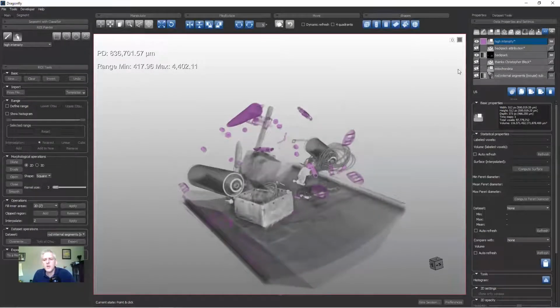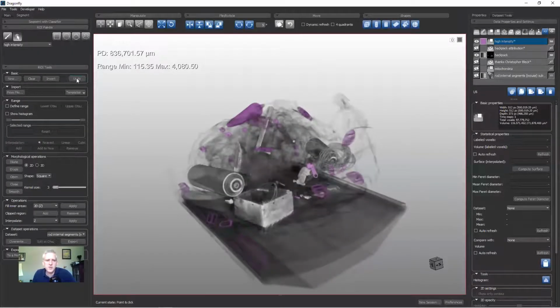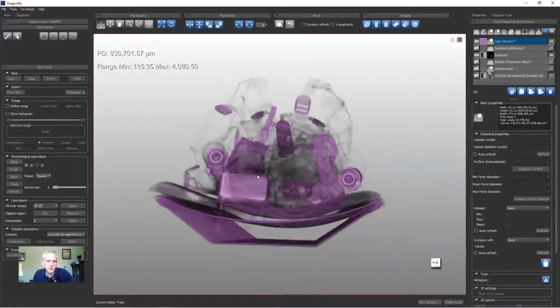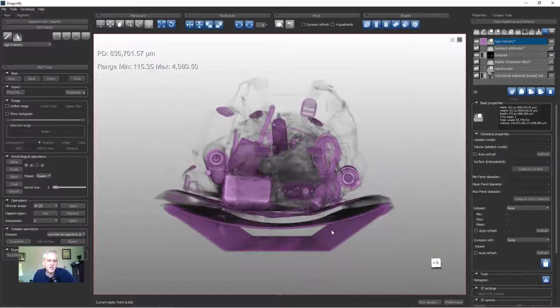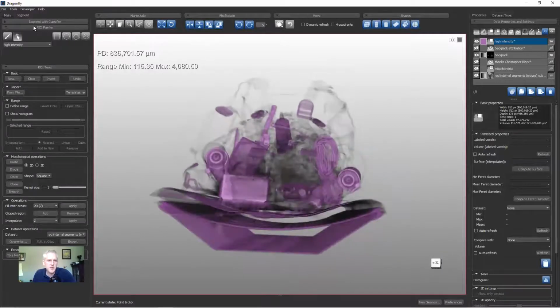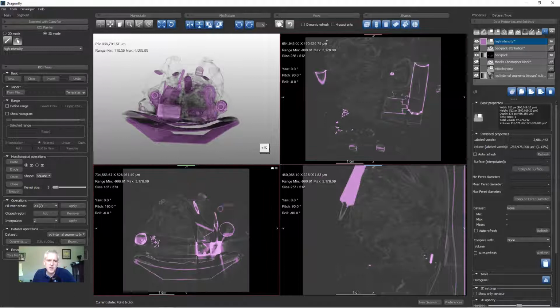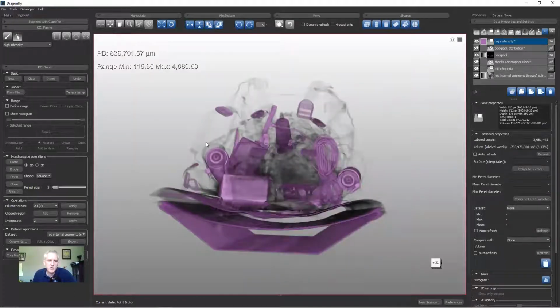So let's suppose that we did not do that. So I hit undo. And maybe we're interested in some of these objects, or maybe we just wanted to use some 3D techniques for refining what is painted. Now, we saw with the mitochondria and the rod internal segments from the mouse data that I can click in these views and operate in these views. Now let's suppose we want to use some tools in the 3D view.